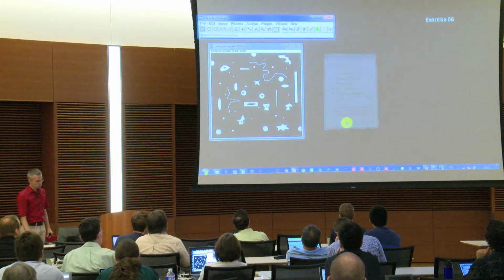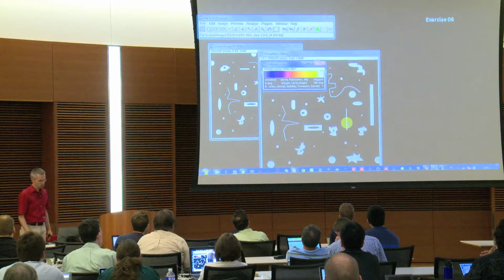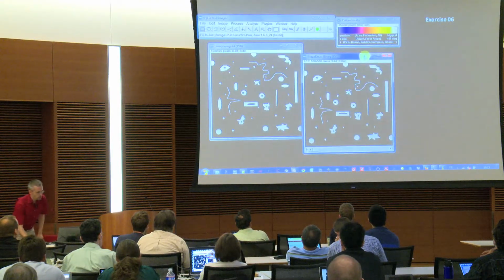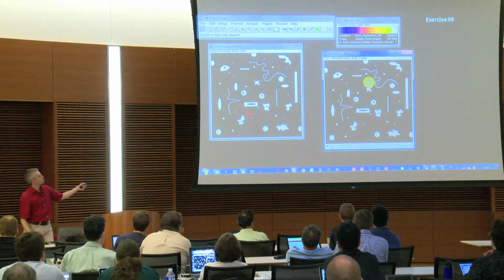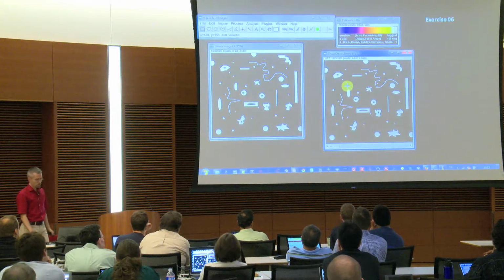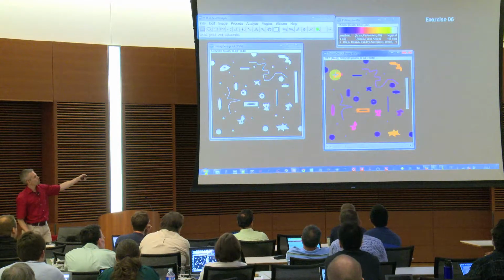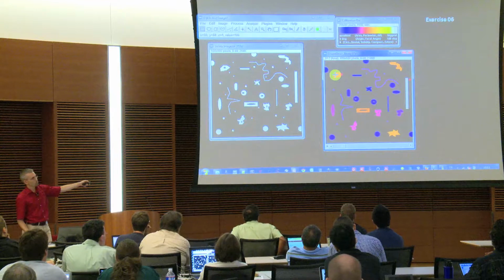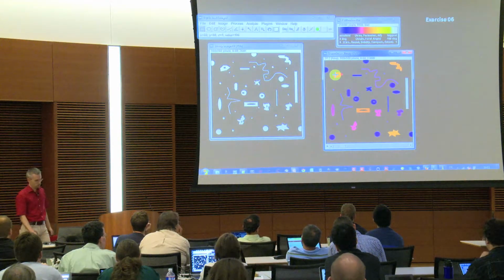So if you now press OK, it takes a little bit. The more particles you have, the longer it takes. So you get this calibration bar. And then you get the original image first. If you have chosen fill holes or so, then you would have these ones filled here. And then if you go through, you get these color-coded ones. So here you see always in brackets what this is. This is now the area, and it's clear that this one is the biggest one, so we can basically identify them and separate them potentially here.